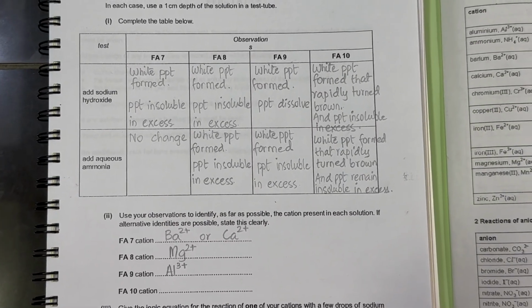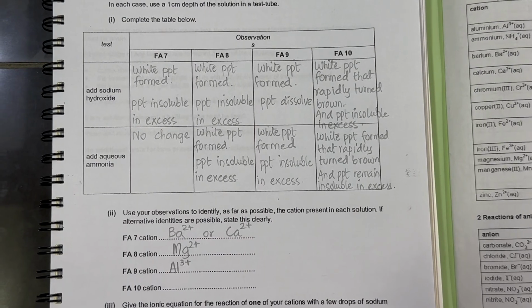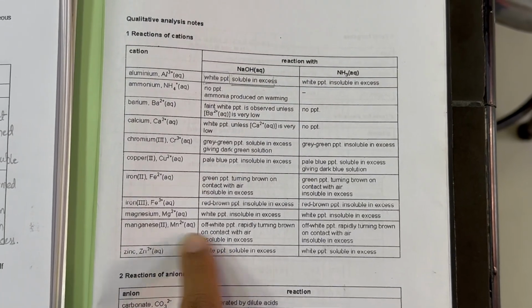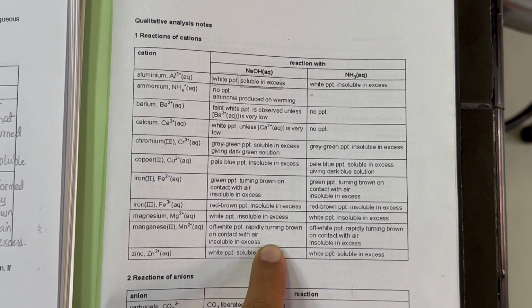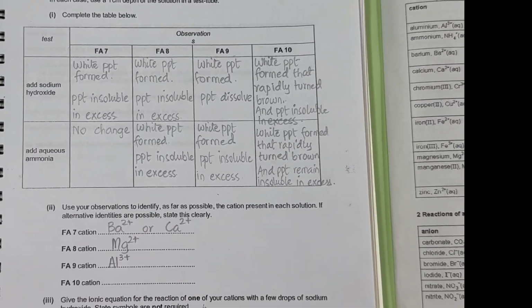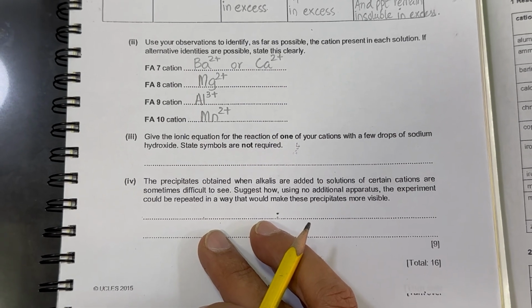Now Fa10 has a white precipitate that turns rapidly brown and is insoluble in excess with both. So here we have only one, Mn2 plus, that gives this type of response of white precipitate turning brown in air and insoluble in excess with both of them. So Fa10 has Mn2 plus. So let's record this also. So we have recorded all these observations and conclusions here.